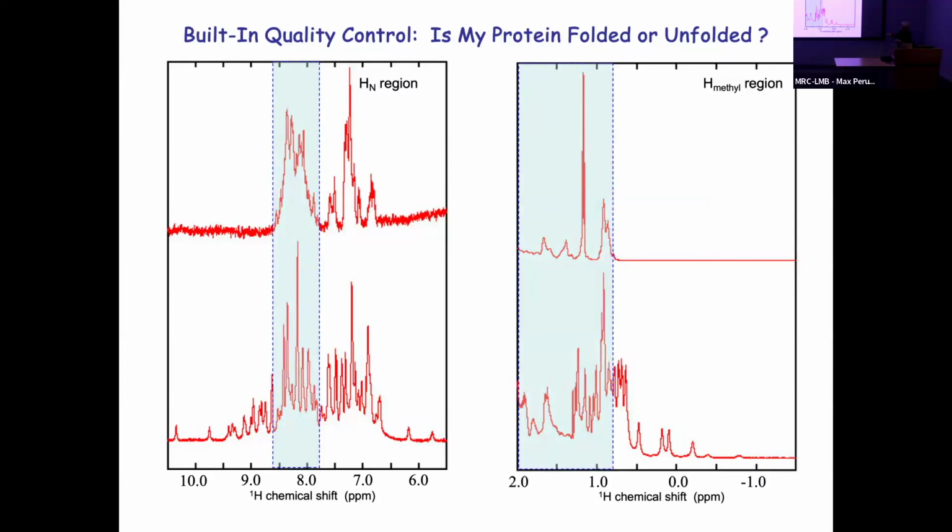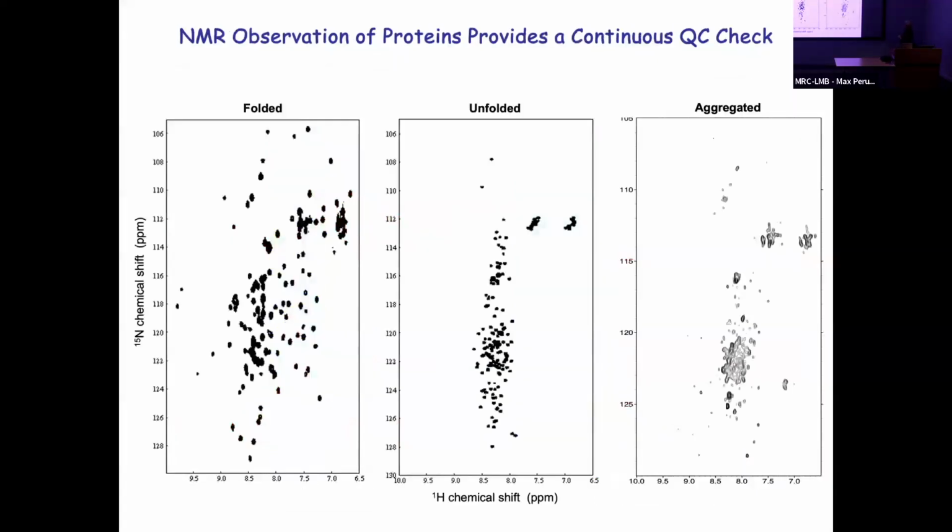And so we instantly can tell somebody, is my protein folded or not? Well, within 5 minutes, we can tell somebody, yes, it is or it isn't. And that is not an insignificant amount of information to give to somebody. If you're doing assays and you're struggling, you don't know what condition your protein is in structurally. NMR can give you an idea. There are other techniques, CD or whatever, that could also tell you, but NMR gives you that information very quickly.